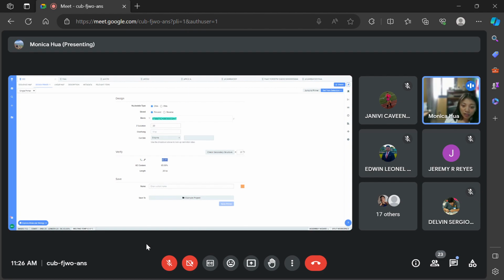My TM is too high. You don't want the TM to go above 60 degrees Celsius, but like I said, because we are fishing out a primer, if you cannot get it below 60 degrees Celsius, it's fine. If that's the lowest you could go.